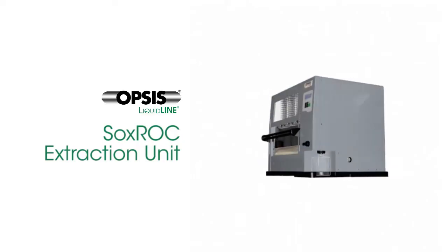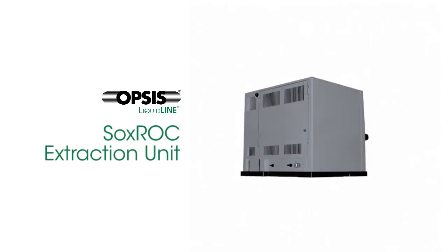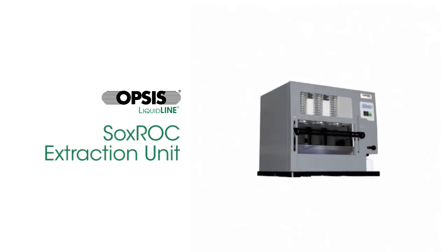The Soxrock extraction unit brings innovation and savings for any hot solvent extraction lab.